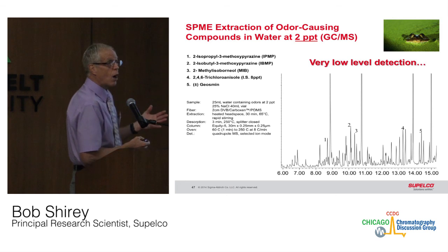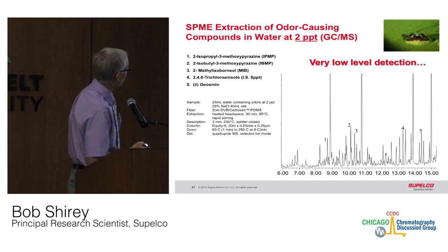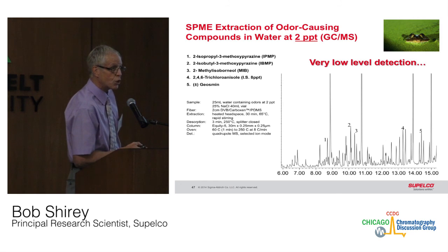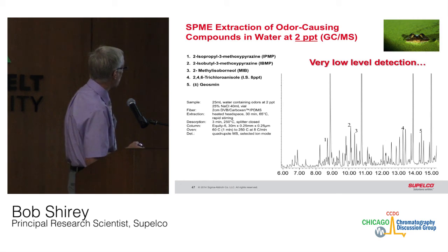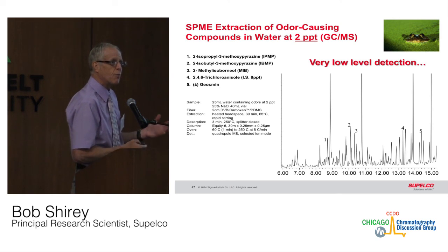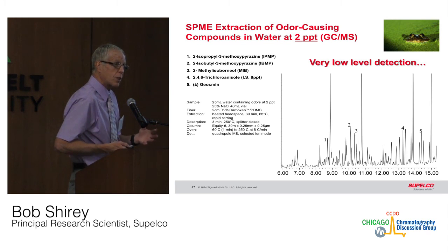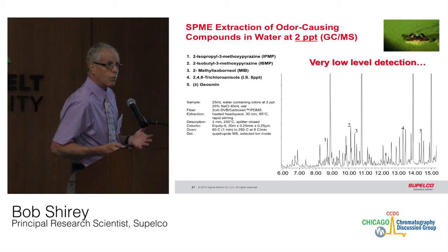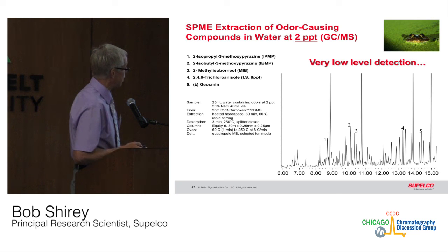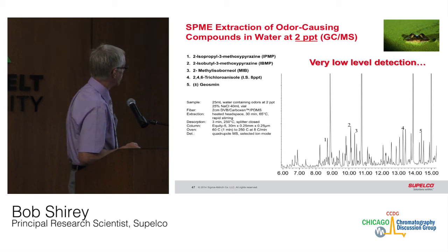This is an example of odor-causing components. These are components that form when blue-green algae grows in reservoirs or ponds. The algae off-gases these musty-like components, and the human nose can often pick these up down to 5 parts per trillion. My wife particularly is very sensitive to these. These components can also be absorbed into fish that are being raised in the ponds, especially a whitefish like tilapia or catfish, which are often raised in farm-raised ponds.